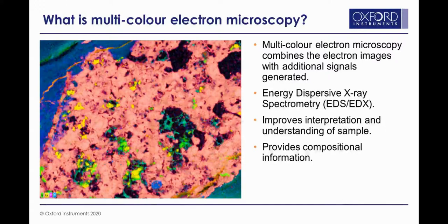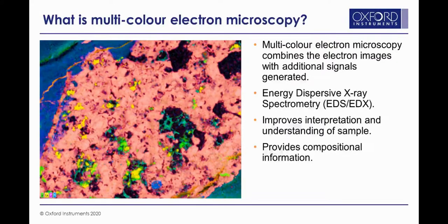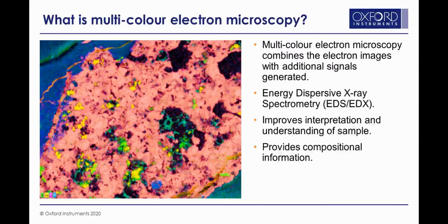Instead, we can use a technique that has been gaining a lot of interest over the past few years: multicolour electron microscopy, combining the electron images with additional signals generated as a result of exposing a biological sample to an electron beam. The resulting image is now much more colourful, and you can clearly see distinct features including the green cellular material scattered throughout the lacunae within the implant. This indicates how multicolour electron microscopy can be a really powerful imaging tool.